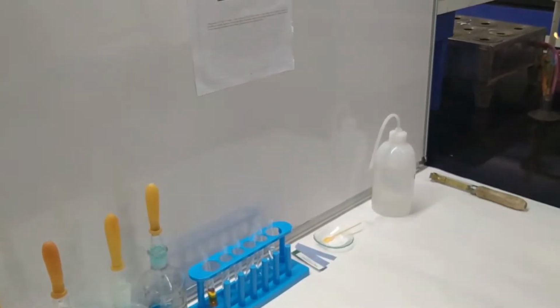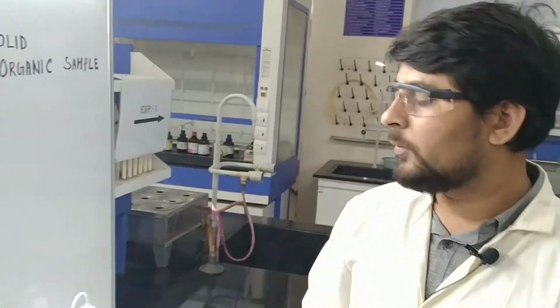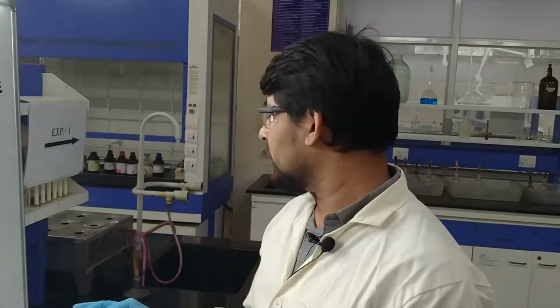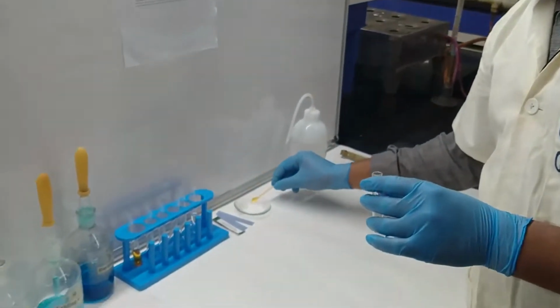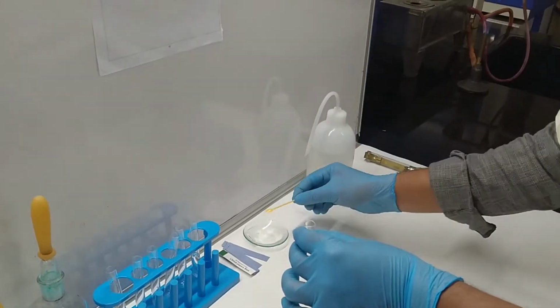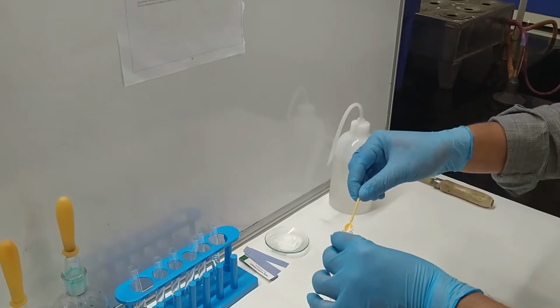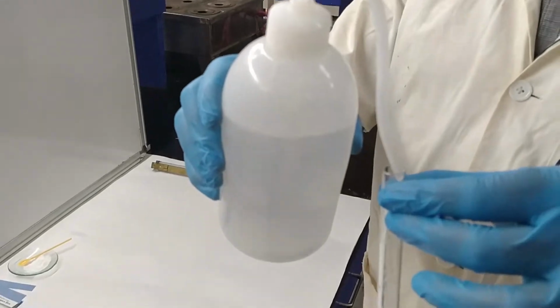For the test, what we have to do is prepare a glucose solution again in water, and then add that prepared Fehling's reagent into the glucose solution, and after that heat the test tube in the hot water bath. Okay, so I just take some solid glucose over here. Pouring some water, distilled water.